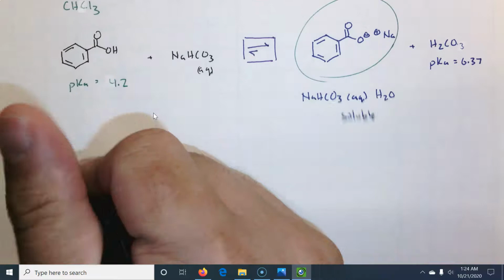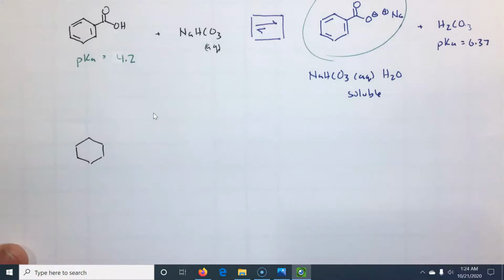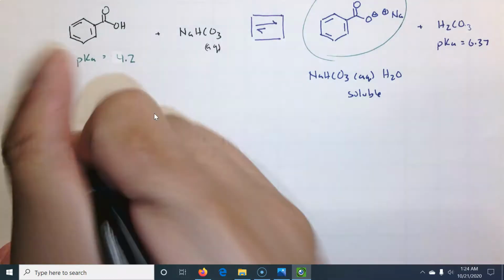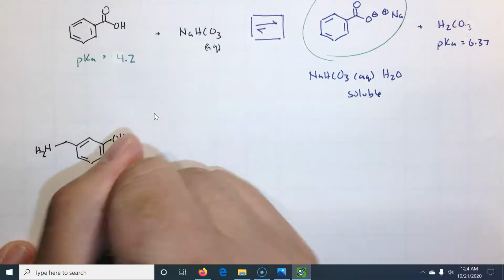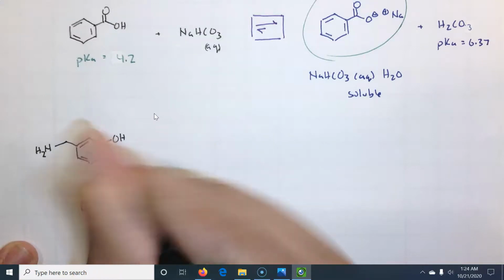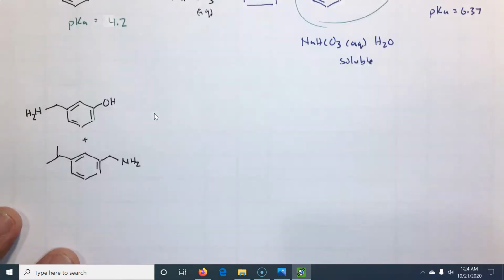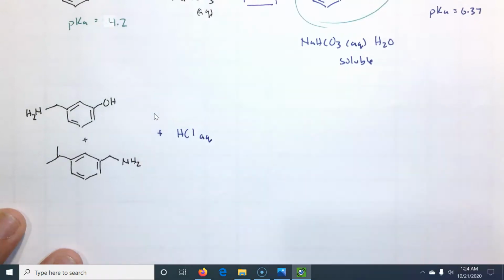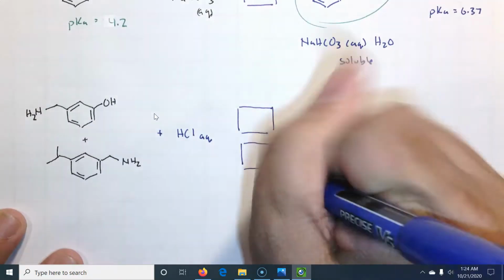Let's say we have these two left, and I'm going to try this to make it a little more clear, because it's actually something I would have tried and realized later that it's not working. Let's say these two are left. If I use now aqueous HCl, I know this looks a little strange. I'm trying to do two reactions at the same time.